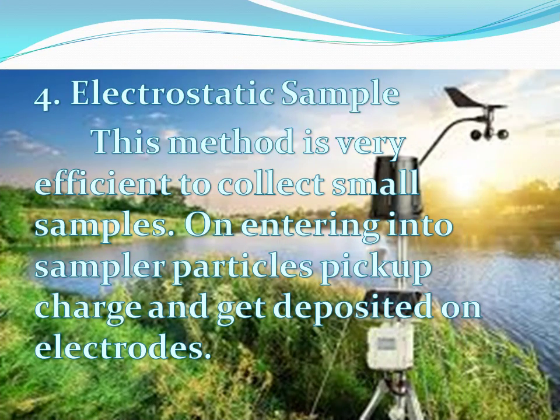Electrostatic sampler. This method is very efficient for collecting small samples. On entering the sampler, particles pick up a charge and get deposited on an electrode.